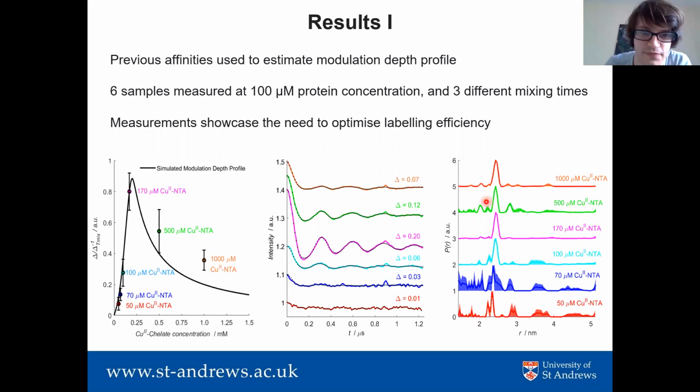I mean, this is just speculative. We don't know for sure that it's non-specific binding, but I know that Sinil observed that there was this secondary binding site for copper in GB1, a native copper binding site. And so the question is, if you have such a vast excess of copper NTA, the off rate won't be very high, but if it's enough, then maybe you begin to saturate this site.